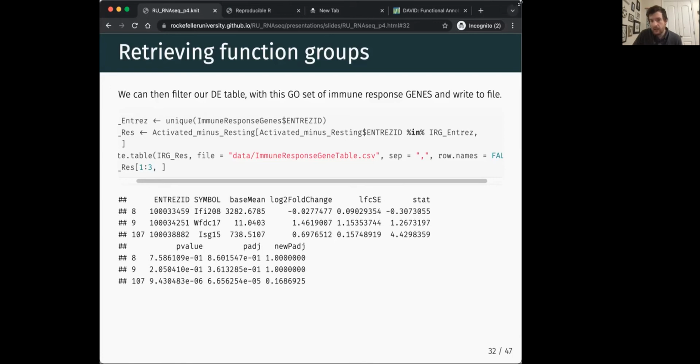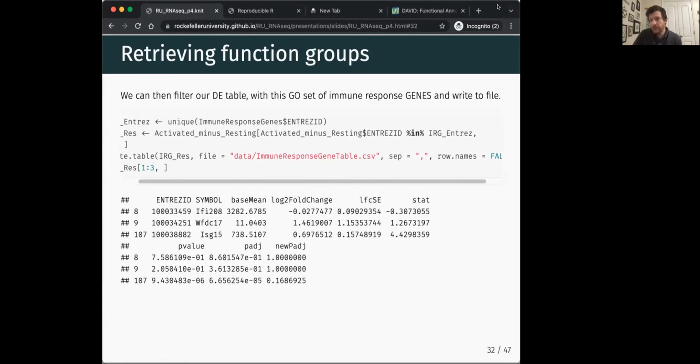That said, it's supposed to be a very, very nice curated data set. So there's a reason that it costs money, because they've put a lot of effort into it. But I'd be curious, once you've learned how to do this, to compare some of the results and see if it's fairly consistent, and what Ingenuity is adding to your analysis.